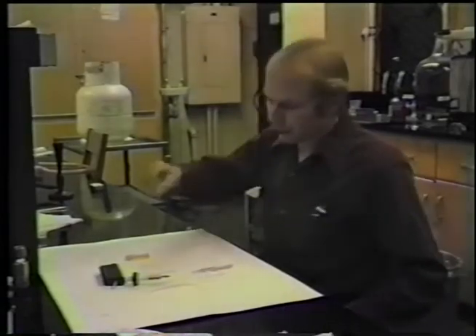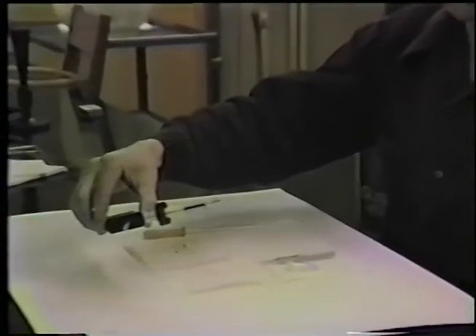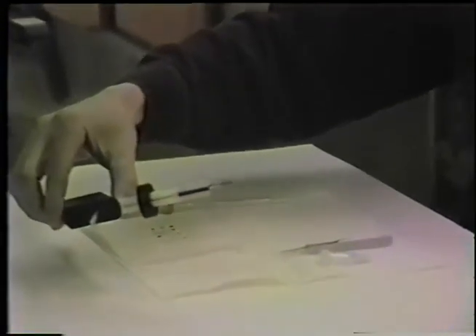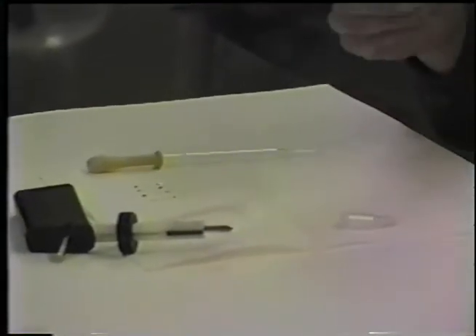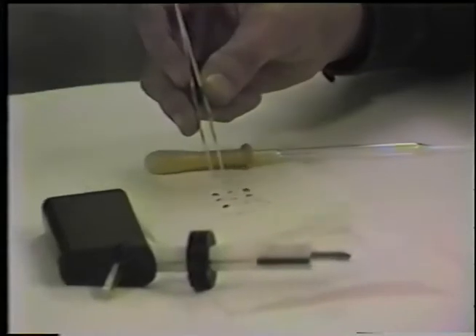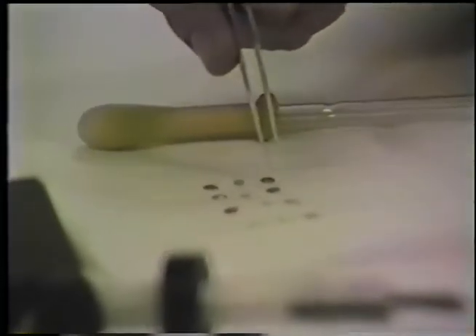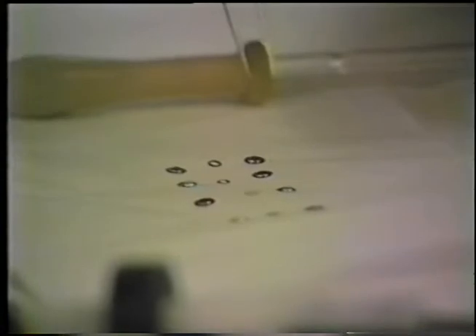Here we have the basic equipment necessary to propane jet freeze biological samples. We have the sample holder itself. We have a pair of forceps. We have 2 rows of Panama hat-shaped metal specimen carriers, 1 row here, 1 row here, 1 pair of carriers for each sample that we intend to freeze.